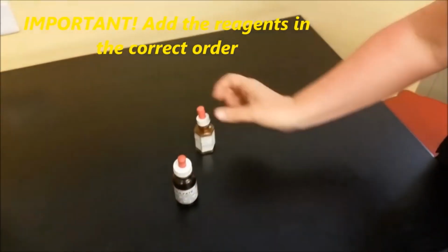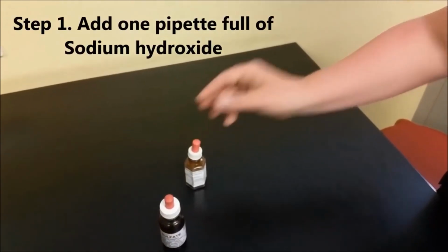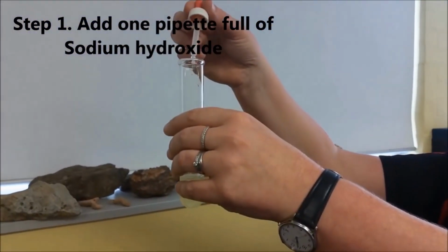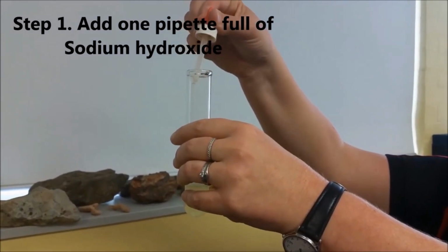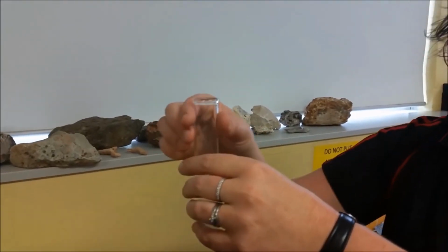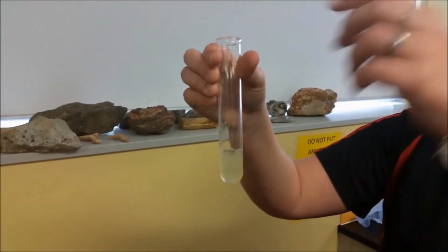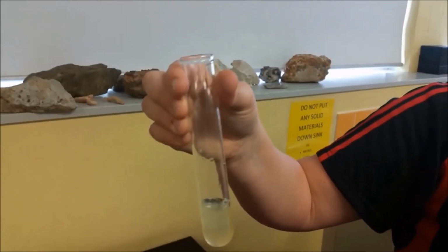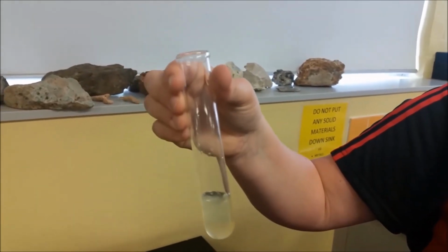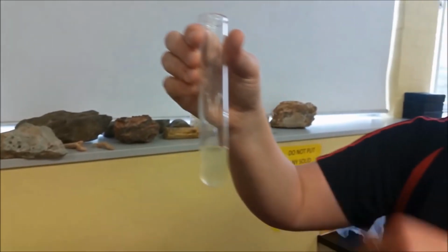When you do the protein test, it's important that you add these in the correct order. The first step is you add 1 pipette full of the sodium hydroxide. Sodium hydroxide is a hazardous chemical, so make sure you are careful with that. As I did there, you place it inside and then squeeze. You don't want it getting onto your fingers. And any time you're using chemicals, what would be the other safety gear you guys should wear? Goggles. Yes, goggles. Good.